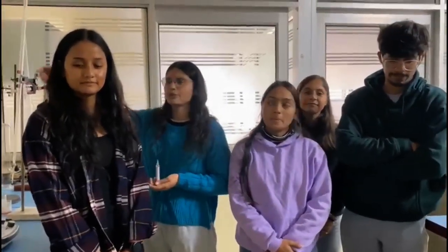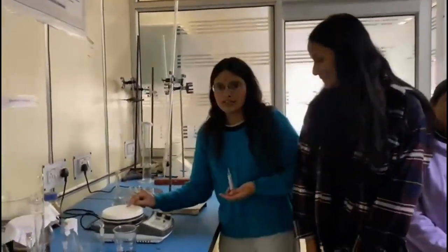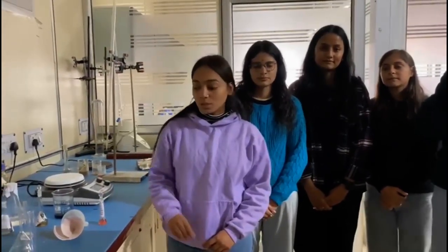put that KCl into the burette and we used a magnetic stirrer there. And we kept the magnet inside the beaker and kept it over the magnetic stirrer. This magnetic stirrer is set for 30 minutes at a temperature of 60 degrees Celsius and the rounds per minute set at 540. And after the completion of 30 minutes, we put the filtrate into this flask and stored it.